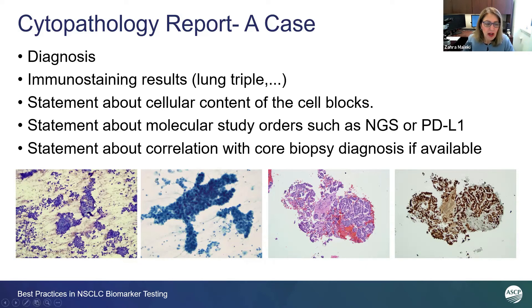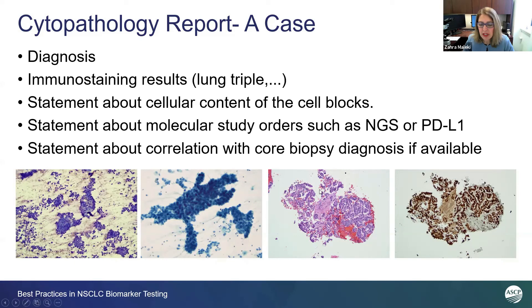As an example of on-site evaluation for lung adenocarcinoma: this is stained with Difquik, and this is alcohol fixation smeared with Papa-Nicolas stain. Here is a beautiful cell block — very cellular. The lung triple stain was positive for nuclear staining for TTF-1 and also cytoplasmic granules for Napsin A.